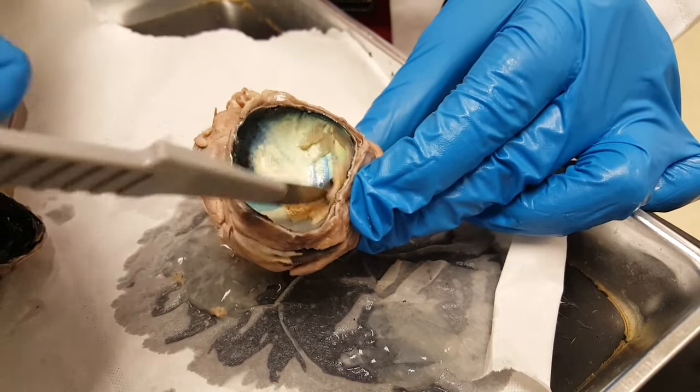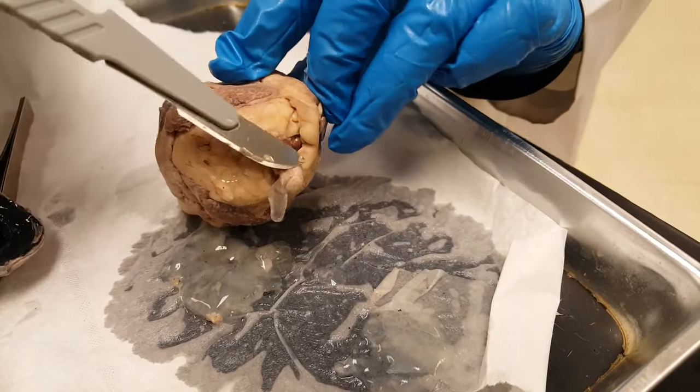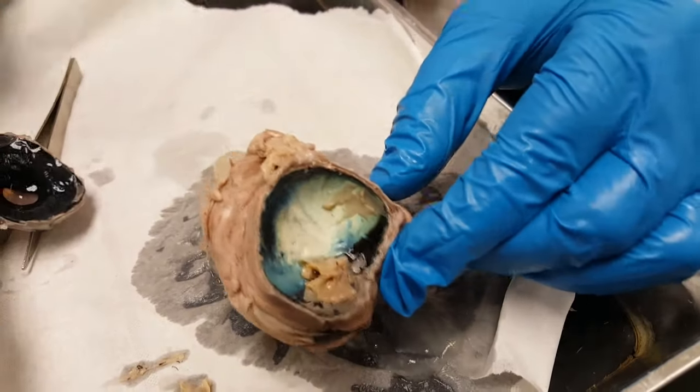There's a spot that won't really peel away — that is where the blind spot is, or where the optic disc is. That's where the nerve connects to the cells on the retina. And that's pretty much all there is to the eye.